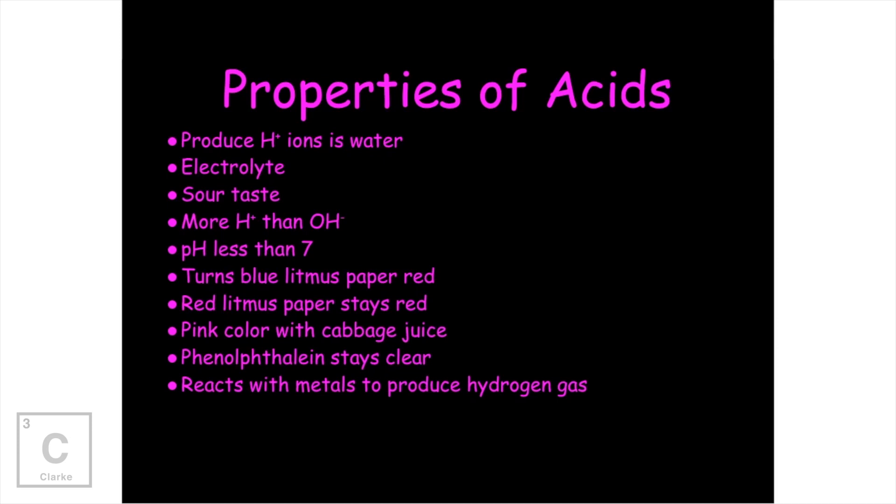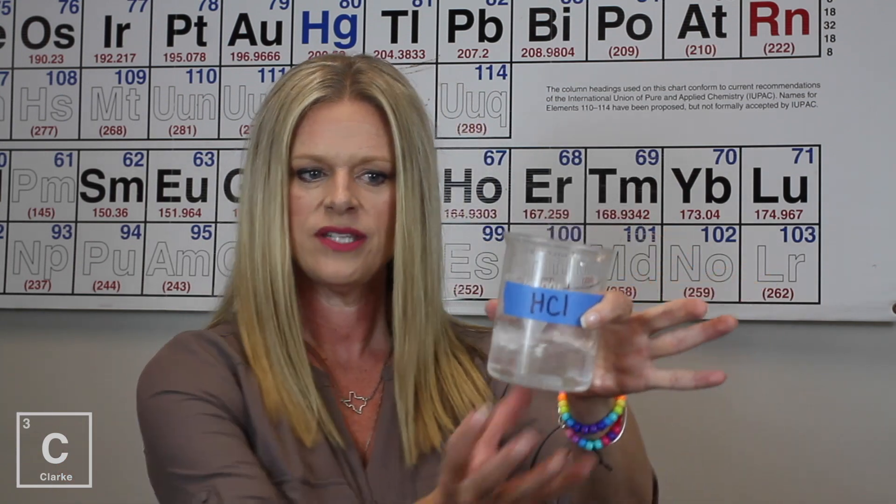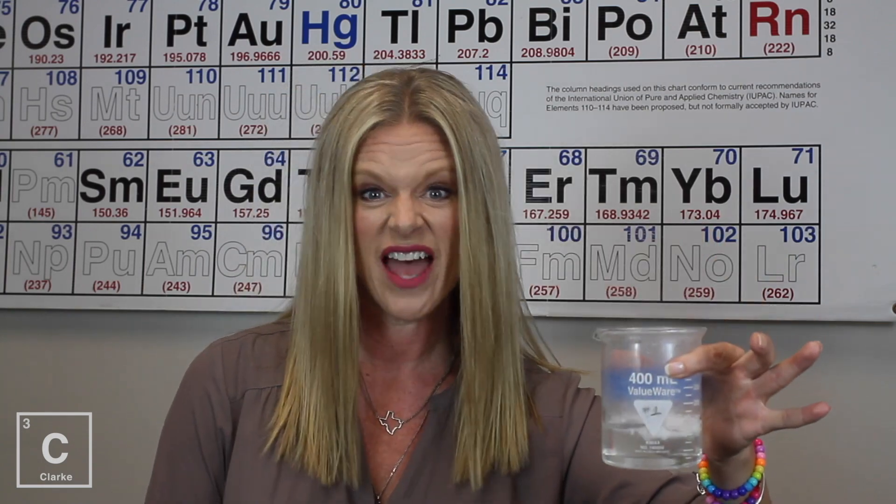Acids also react to metals to produce hydrogen gas. I have some calcium metal. I know, calcium, it's a metal. Let's get our hydrochloric acid and let's test to make sure that, in fact, acids react to metals. Can we see that? Pretty violent reaction. Let me go put that in the vent hood.